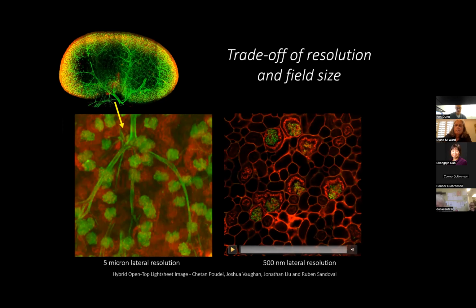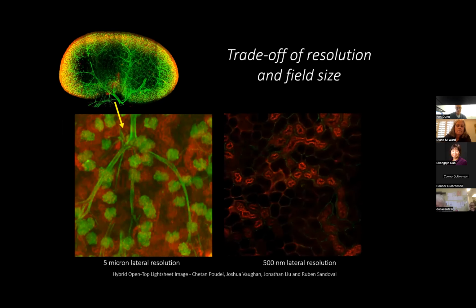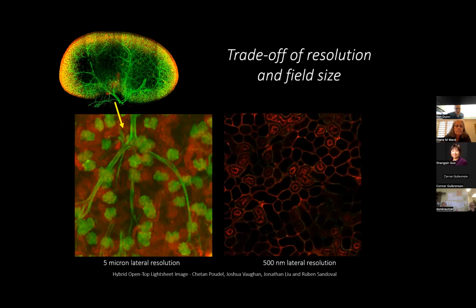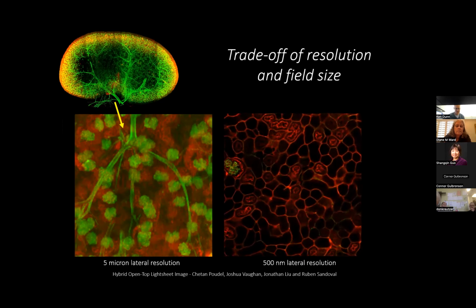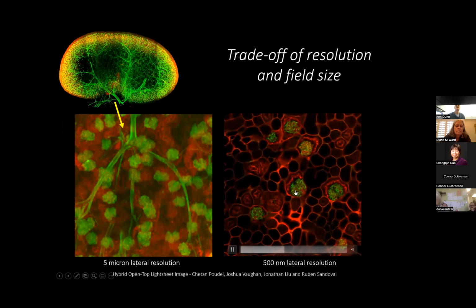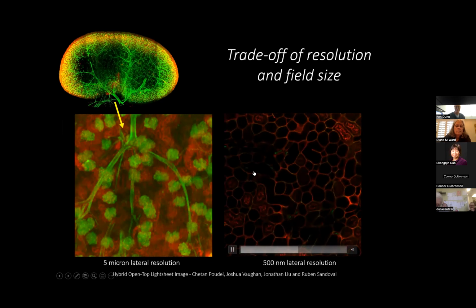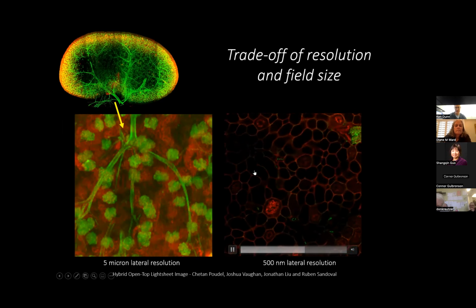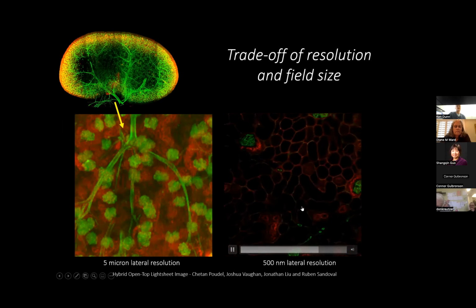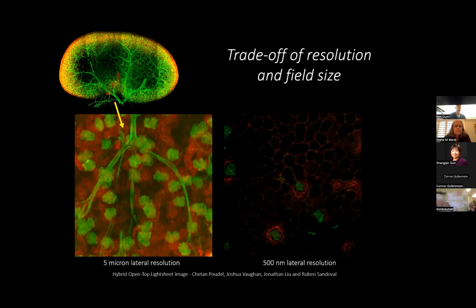That same volume, there we go. This is scrolling through the volume from the bottom up to the top. And at some point we'll encounter a glomerulus. There we go. These are all glomeruli, and the red spots surrounding glomeruli are endosomes of the proximal tubule. So you're detecting individual endosomes inside this gigantic tissue. But again, this resolution comes at the expense of scale, if you will.